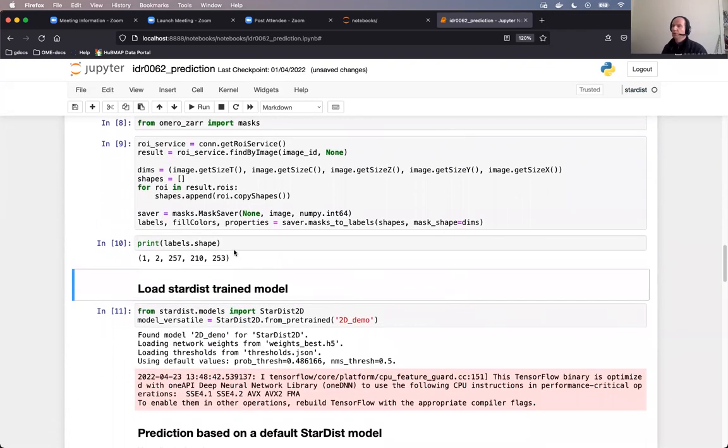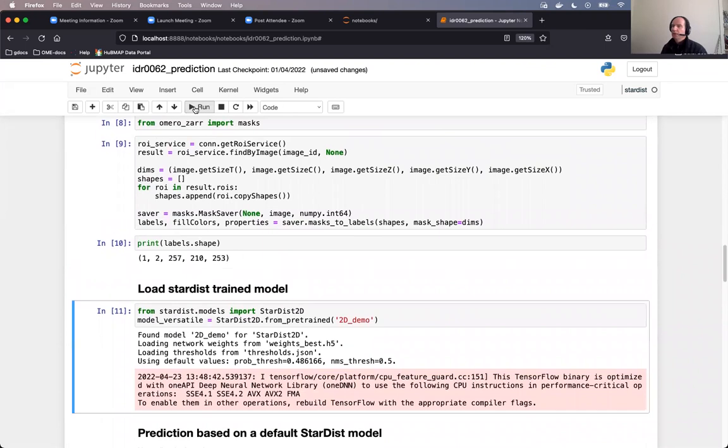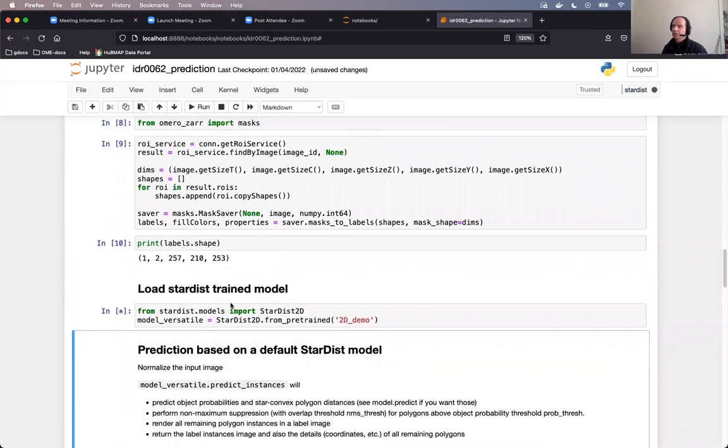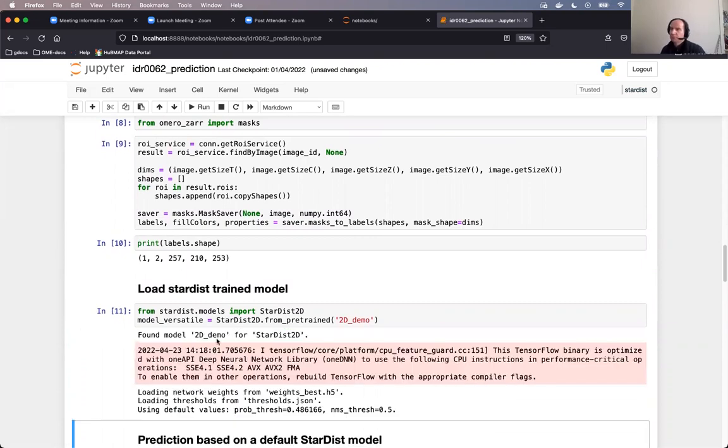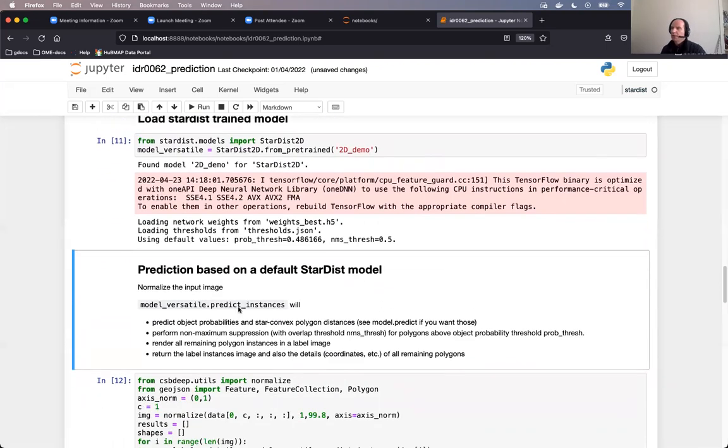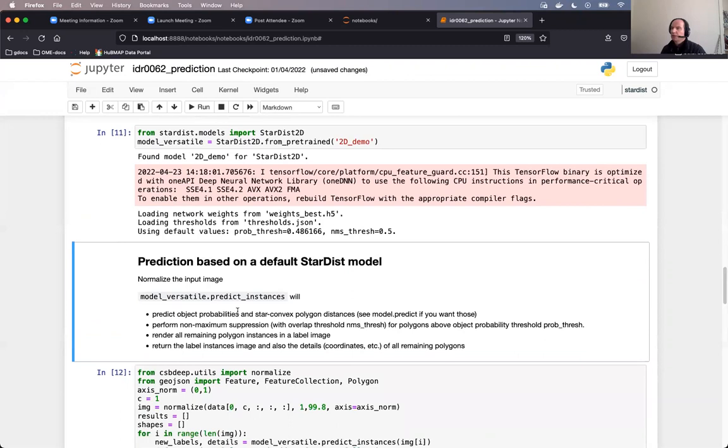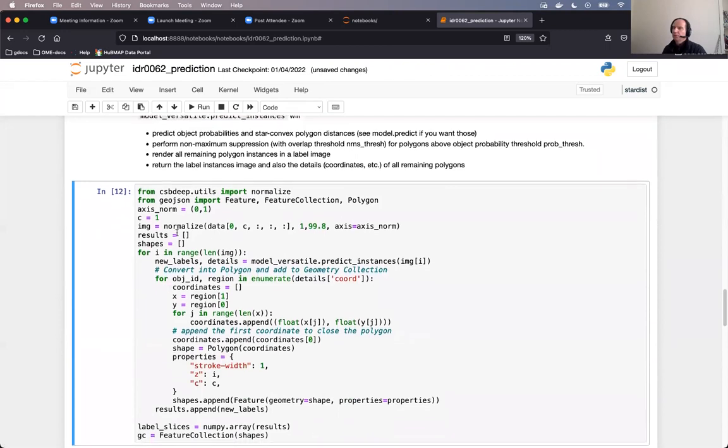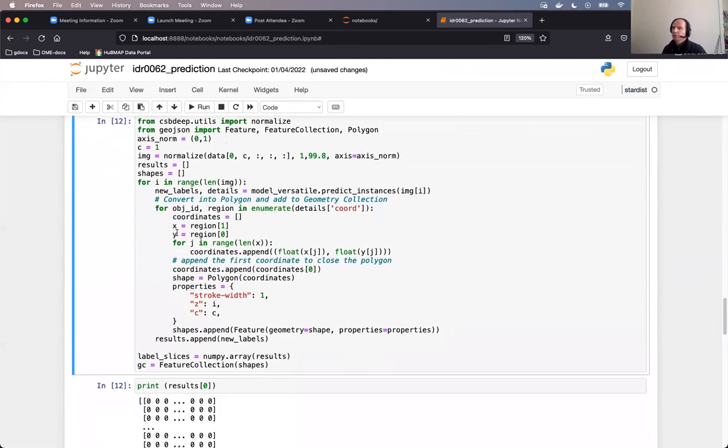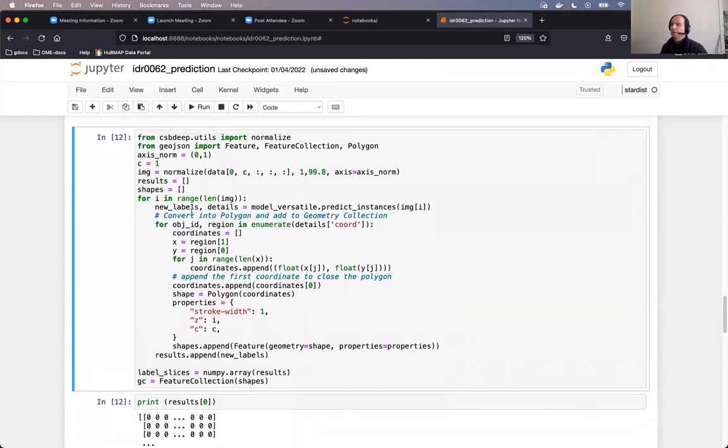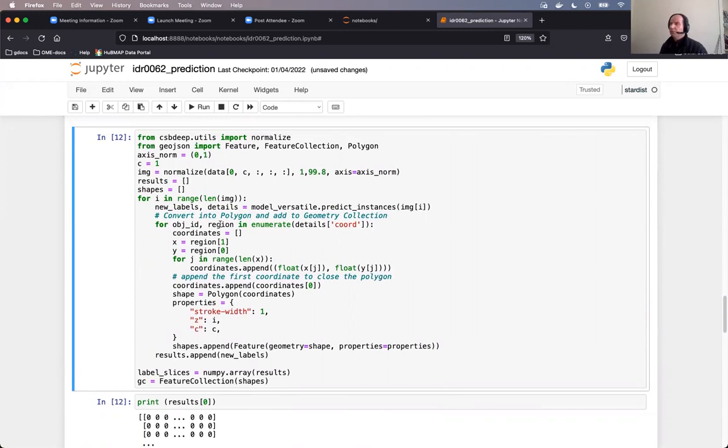Now we will load the Stardist trained model. This is the default Stardist model. We don't have any ambition to be perfect in our segmentation. This is done. In the next cell, the Stardist model is applied on the segmentation of our image. And in this cell, we will basically iterate through the planes of the image. And in each plane, we will perform the segmentation. Stardist will do it better said for us. We will use channel one for that segmentation of the image.